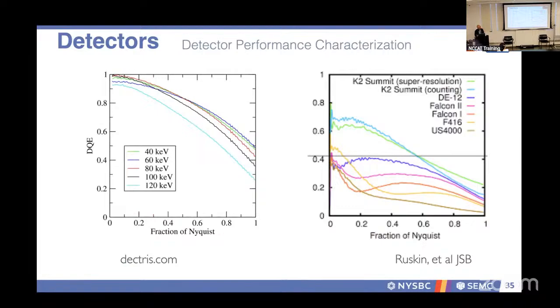However, as you can see in the graph on the right, the frequencies are not uniform in terms of the readout. And so the way that certain detectors are manufactured, you may have better detection at higher and higher kVs. And the reason for that is that your electron, if it's moving too slow, can interact with the sensor, and you could have secondary events.